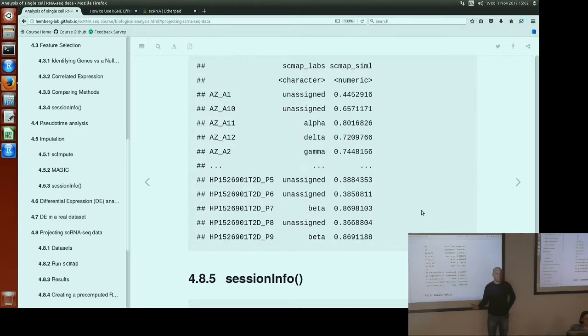So for the human cell atlas application, for example, once they have a large collection of data sets where they annotated all the cells quite well, and they believe this is good annotation, then this can be used for the newly coming data sets. For example, if you have 1 million cells in your atlas and you clustered them, then you have another data set with 1,000 cells. You don't want to merge them together and then recluster everything, right? This will take a lot of time.